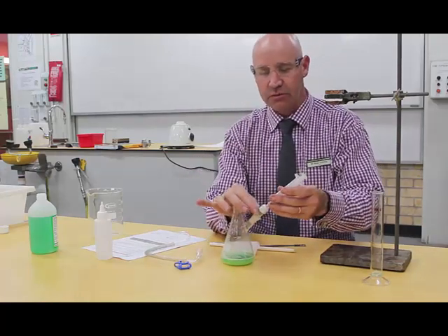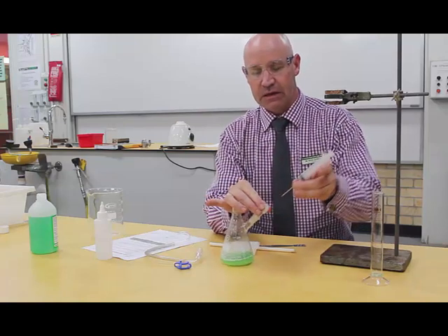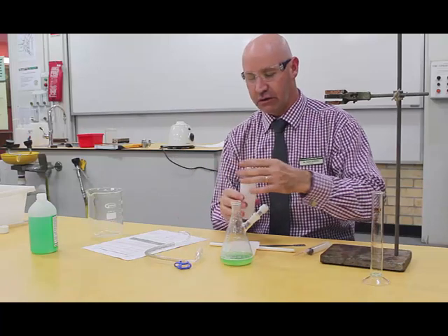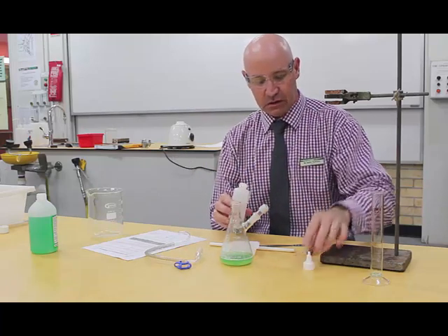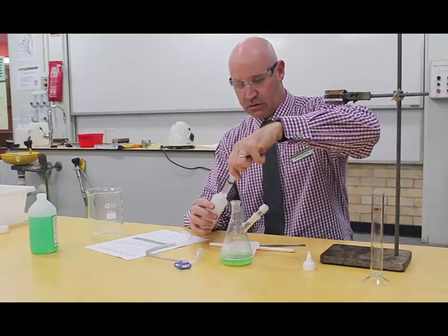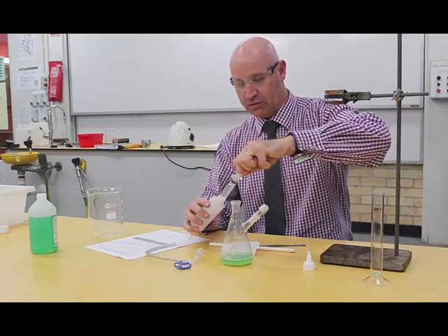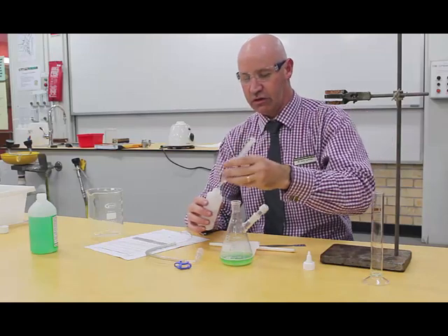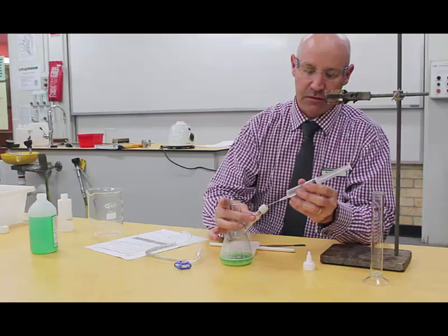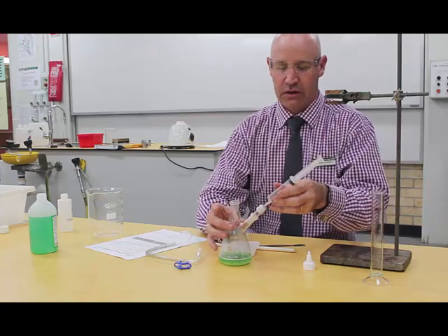Now, our hydrogen peroxide is 10% hydrogen peroxide. I'm going to draw that up in the syringe. Okay, and we need 10 mils of our hydrogen peroxide solution. So that's 10 mils. As I said, it's 10% solution, and that goes in there.